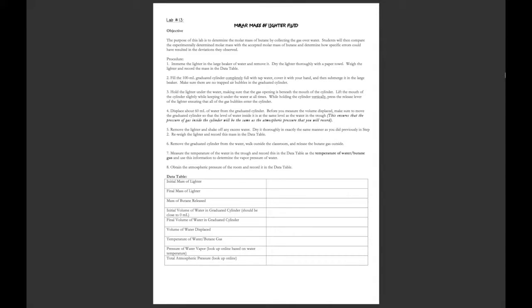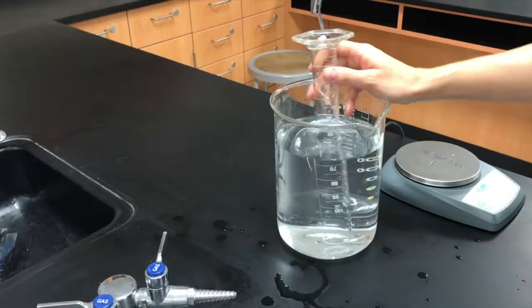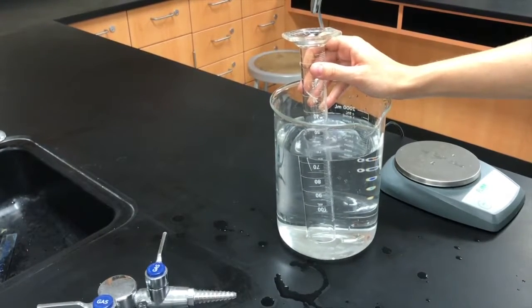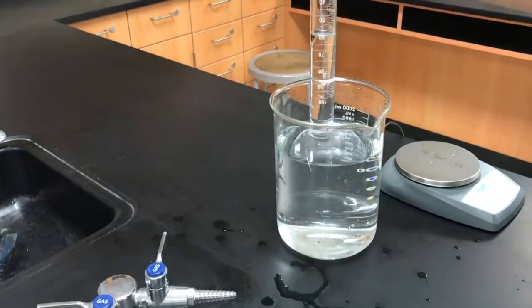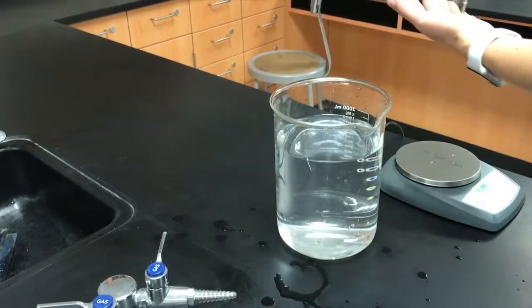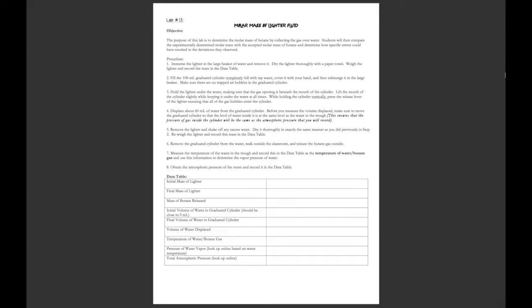Then you're going to remove the graduated cylinder from the water, walk outside the classroom, and release the butane gas outside. Then, in order to dispose of this gas, because this is butane and I don't want my room smelling, what you're going to do is release the rest of the water. You're going to cover it with your hand, and you will take it outside, and then you can turn it right side up. Then you're going to measure the temperature of water in the trough or the beaker and record this in the data table as the temperature of water and the temperature of the butane gas, and use this information to determine the vapor pressure of water. Finally, you're going to obtain the atmospheric pressure of the room, and you're going to record that in your data table.